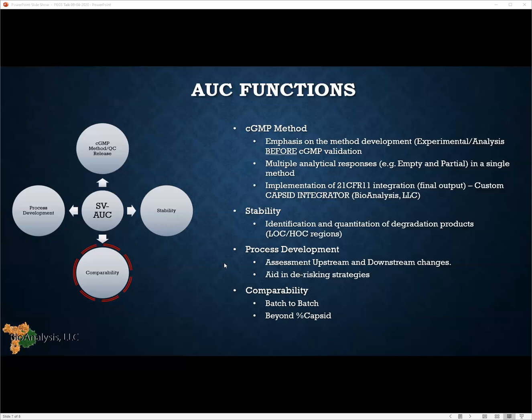But overall, AUC has presented itself as one of the workhorses of the AAV field. I know I stressed a lot about this in terms of the biophysical realm, but I think it's very important to figure out what technique can help you get your product to market. In this case, AUC is one of the best ones.